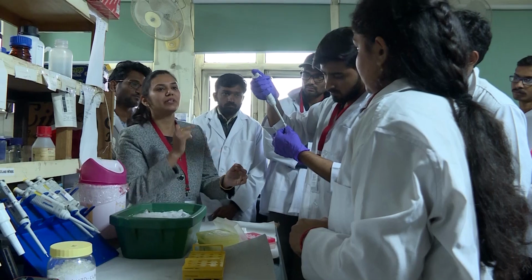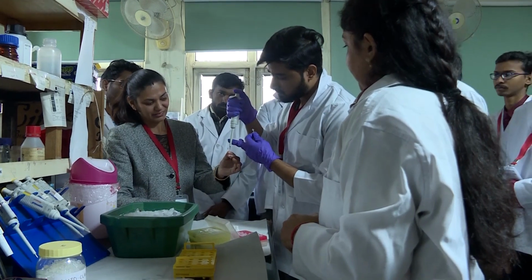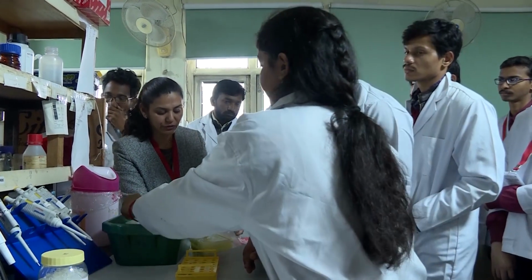Otherwise, it may contaminate your stock solution, so that will be more expensive. Okay, so cDNA for control is over. Now cDNA for heat stress.